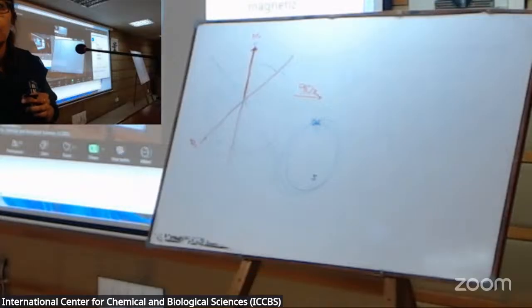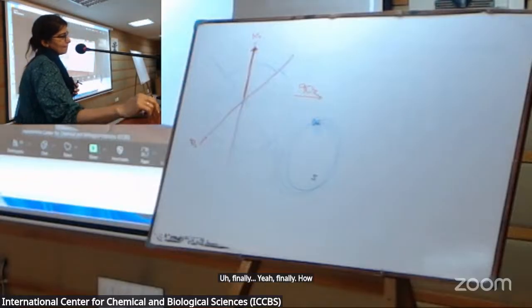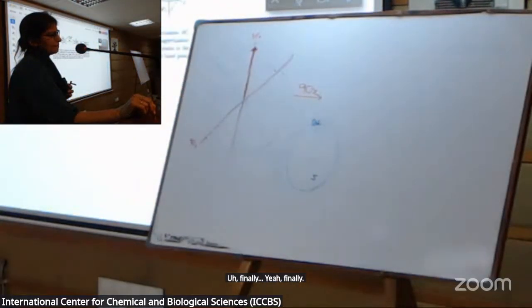Another thing I would like to say: how can we make the direction? What is the meaning of 90x? It takes the theta, the angle 90. How does the radio frequency make this 90 theta? According to the time. For example, we saw before if the pulse is coming from this direction at 90. What is the meaning of it? It is right, but how can we do that? It depends on the time.